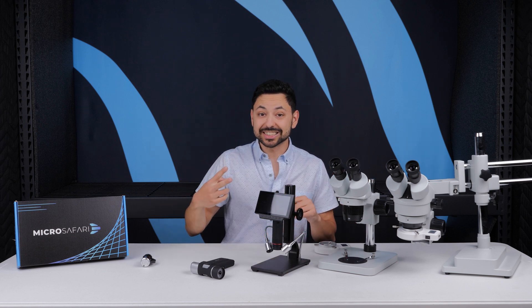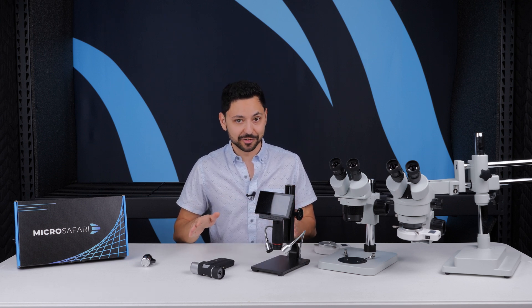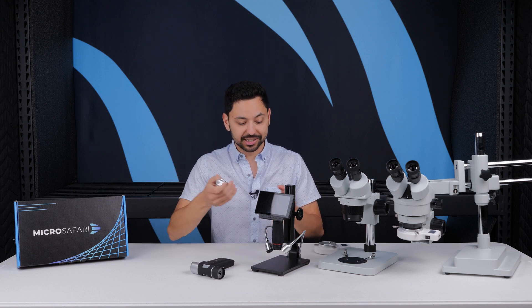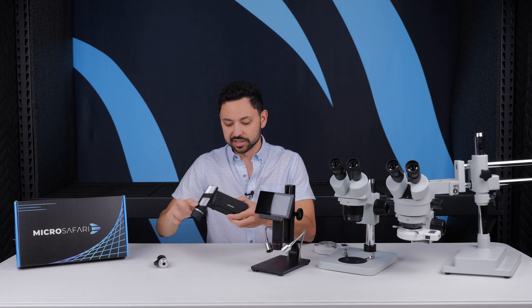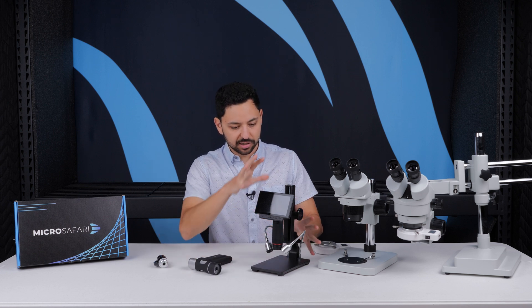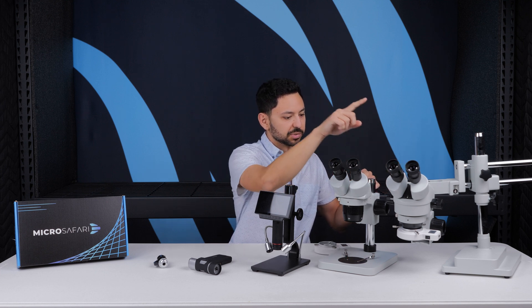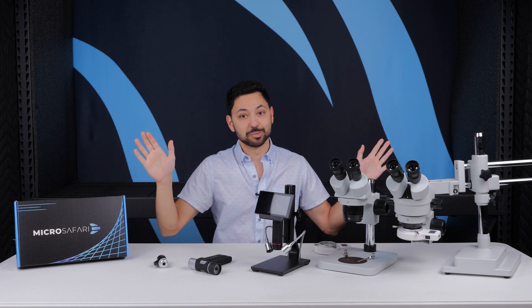My second piece of advice is to not fret over magnification levels. I do not recommend getting high magnification for kids. People are rather surprised at how far you can get with a small amount of magnification. The smartphone microscope has about 30x magnification and that lets you see the sweat pores on my fingerprint. The Anonstar portable one can go around that plus up to about 90x. The Anonstar stand microscope can do the same thing. These stereo microscopes are less than that—this one is 20 to 40x and then the other goes up to about 60x. So much cool stuff that you can see at just those small magnifications.